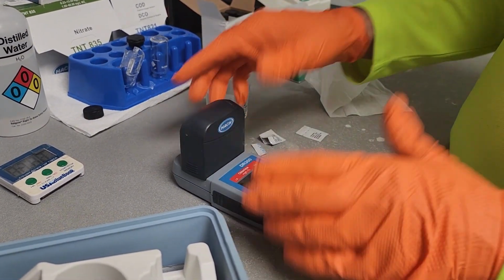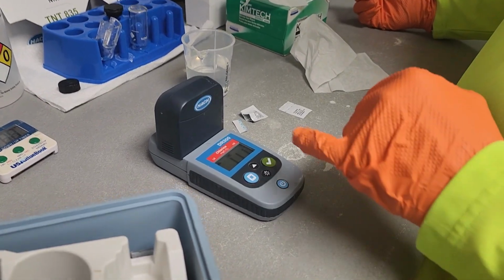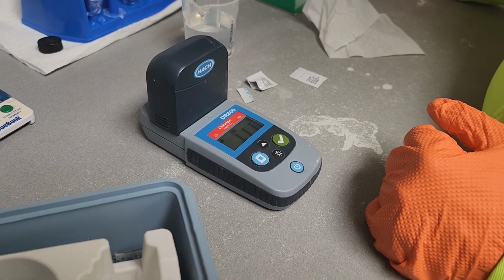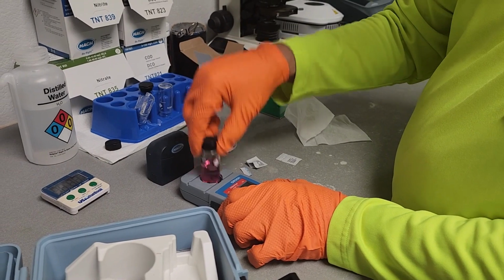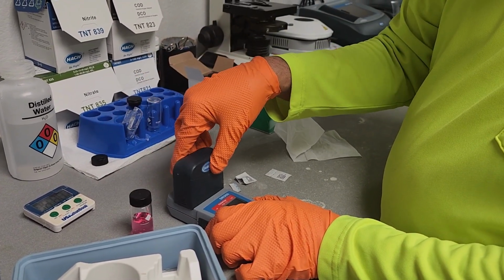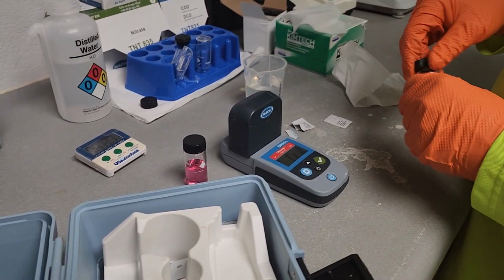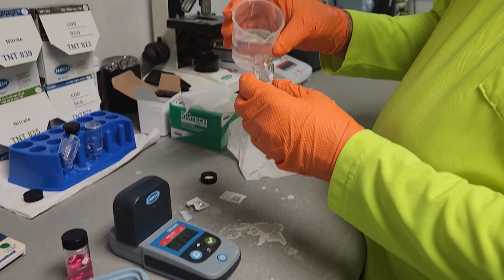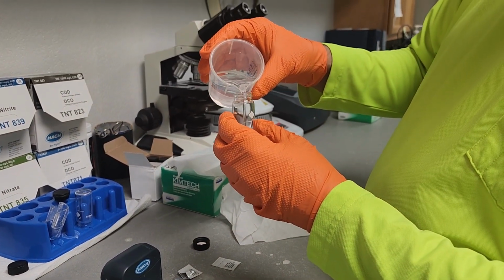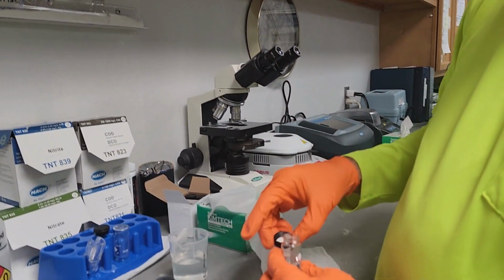And with free chlorine residual, you want to do that within a minute. And I hit the green button. Now we have a 1.11 free chlorine residual. Take that off. Move this. Now, if I set it there and leave it that way, it's going to continue to react, and it's going to get darker. But that's okay because we're done with it. We've got a free chlorine residual of 1.11. I got a good level there.